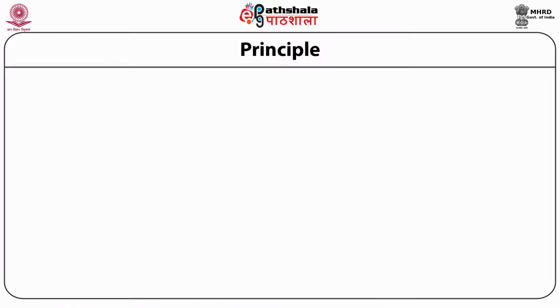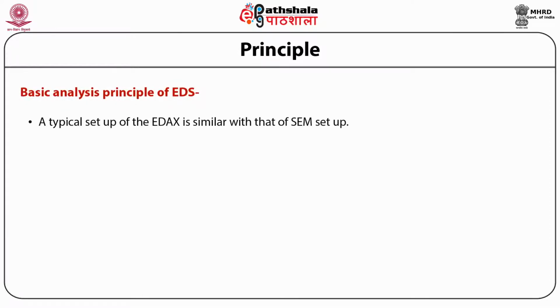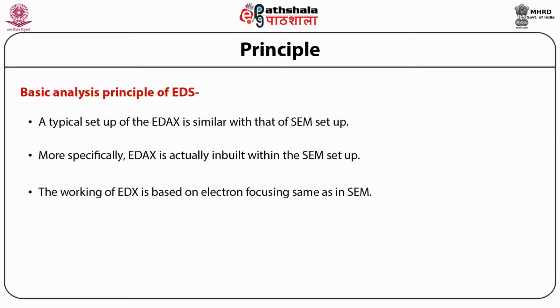Let us study the basic principle of EDS. A typical setup of the EDAX is similar to that of the SEM setup. More specifically, EDAX is actually inbuilt within the SEM setup. The working of EDX is based on electron focusing, same as in SEM.